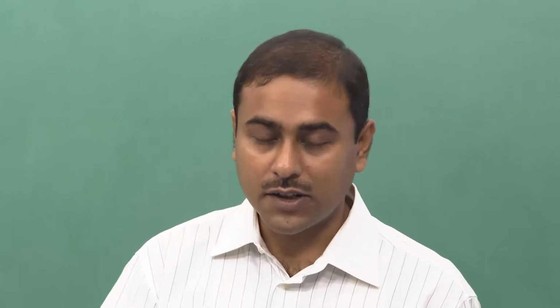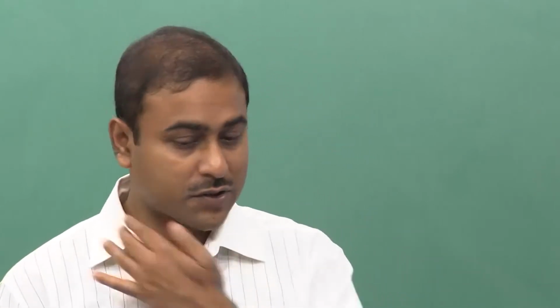We will also see how to measure the emission spectra, how to measure the excitation spectrum, and whether the relationship holds good that I mentioned in one of the properties, that the excitation spectrum is the same as the absorption spectrum. So, let us start one by one, because there is a lot to do in this lecture today. First, let me start with the basic design of the fluorimeter.